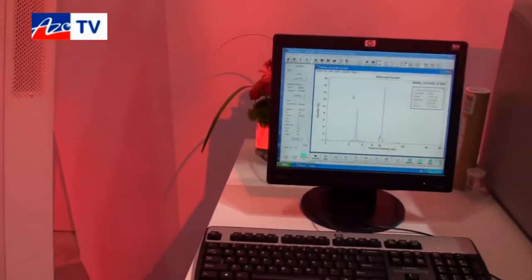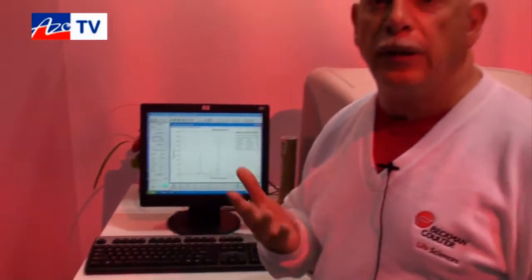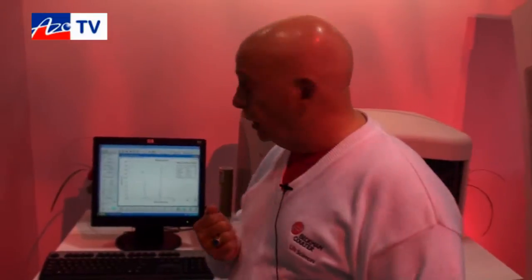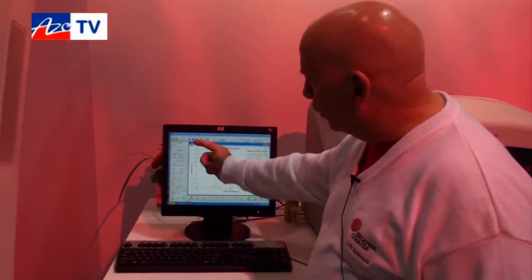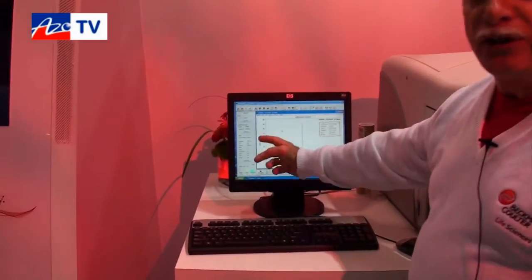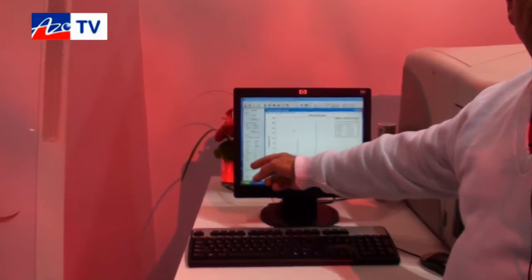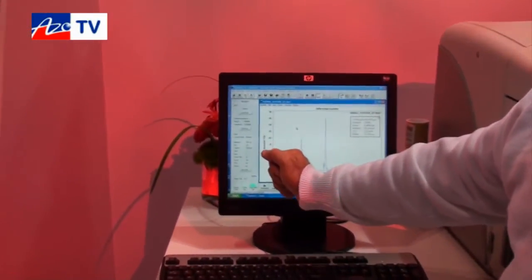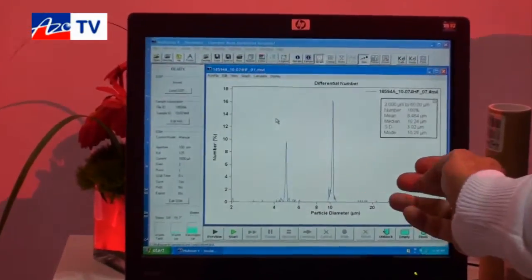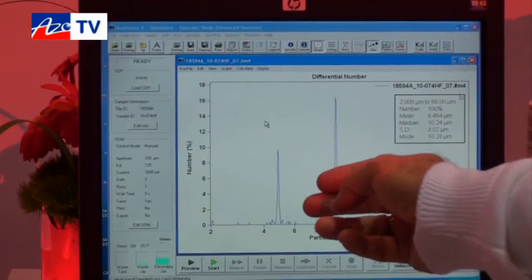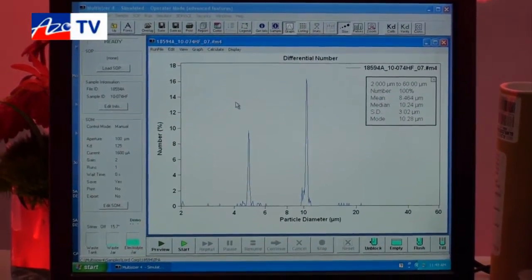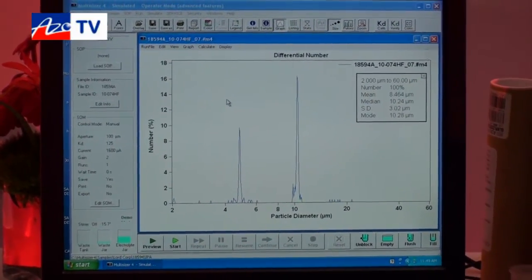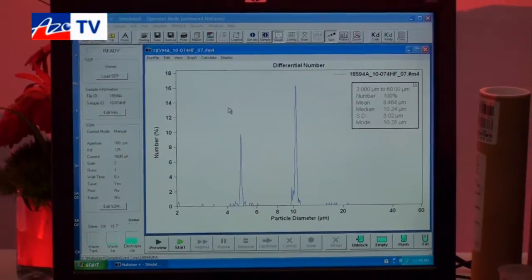There is no mathematical conversion as in many other technologies. This is the instrument control interface where you actually control the operation of the instrument. This is a graph and statistical results of the samples that you happen to be analyzing.